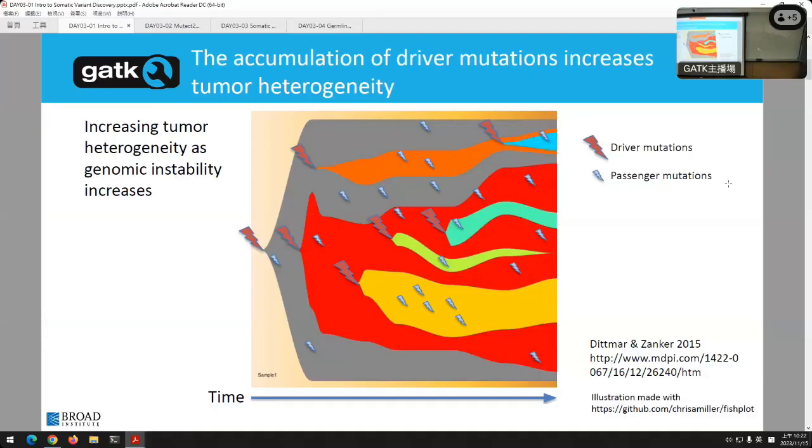So if you were going to take a piece of this tumor for sequencing, you'd grab a whole bunch, you'd grab some of the red and the yellow and the greens, and they'd all come together, and that's what you find. So this is very important, unlike in the germline side, where you expect half of the DNA from your mother and half from your father, and we know you have a 50-50 relationship on your heterozygous SNPs. That's no longer true in cancer. Okay.